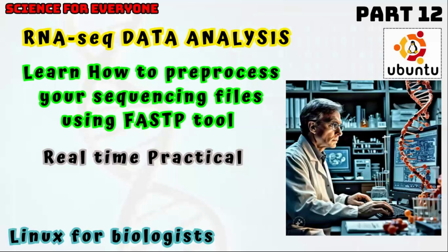I will meet you in part 13 of this video series, where I will show you how to download your reference data and how to perform indexing. Because now we are moving towards the alignment phase. Our files have been pre-processed, and now we have to align them with the human reference genome to check which genes are present in our samples.